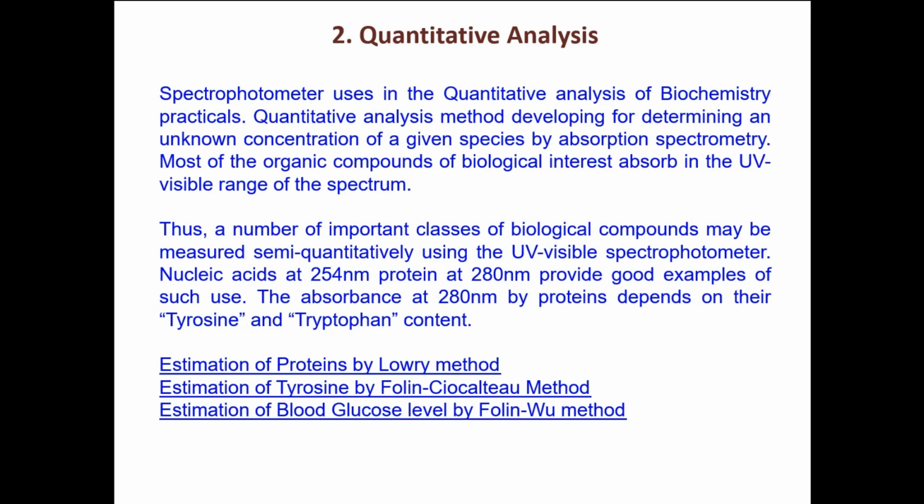So as and when we place another tube with the enzyme, the enzyme will produce the product, and we want to characterize the amount of product produced in the reaction. So we are going to measure only the product. But in any enzymatic reaction, there is substrate, coenzymes, cofactors, buffer and other interference. What we do is make the absorbance of all these molecules zero, and only the newly forming product's optical density will be measured, right?